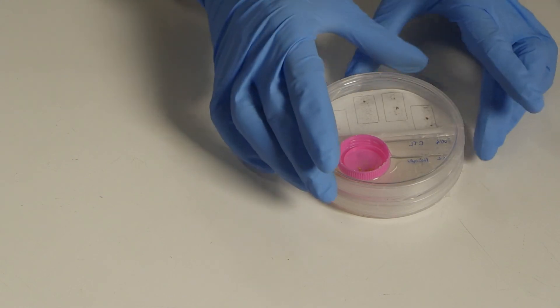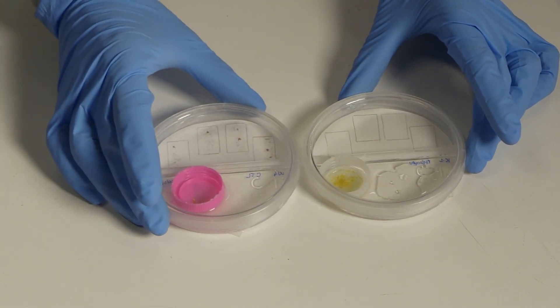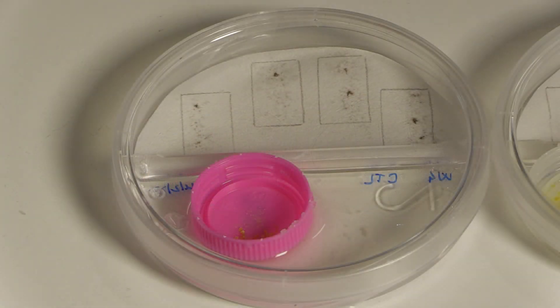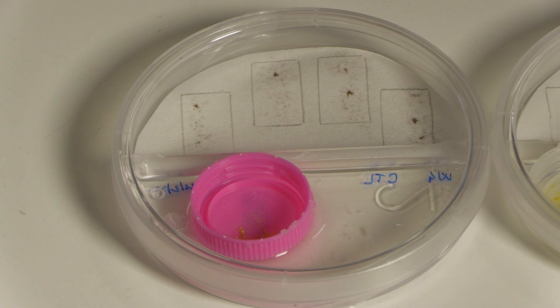The proliferation of the fungus is clearly visible to the naked eye for the non-treated paper sample, whereas no visible growth can be observed on paper exposed to essential oil complexed with beta cyclodextrin.